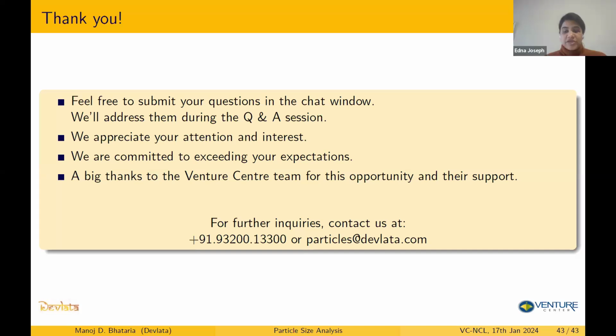Sure. So, thank you, sir. And I think the follow-up question by another participant was on how to prepare solutions for DLS. I think you've already covered that. She wants to know what should be the dilutions for DLS particle sizing. So, any insights you'd like to share about the dilutions that we prepare?